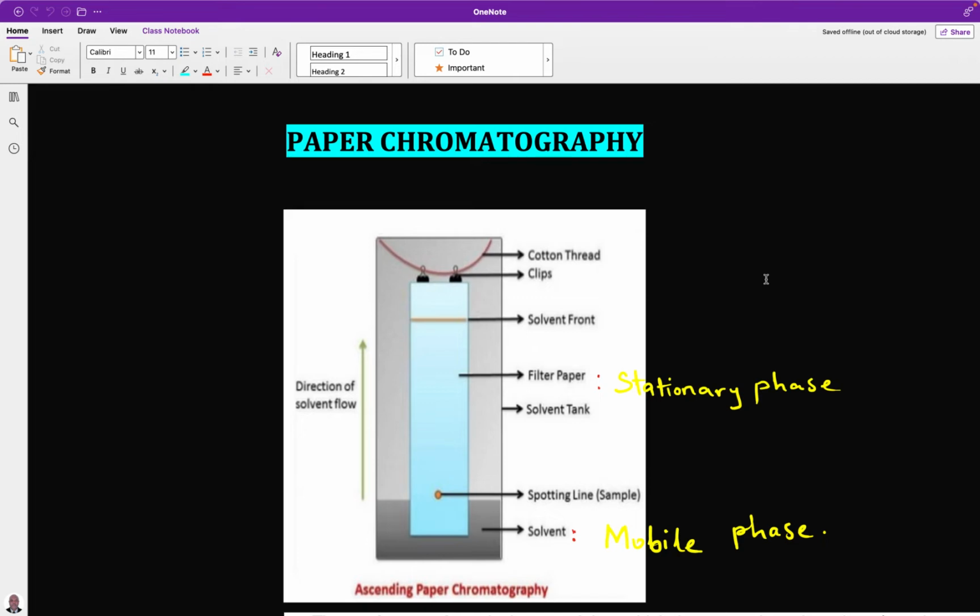In research centers, it is used for the analysis of a reaction mixture in a biochemical laboratory. It is also used in the environmental sector and the water supply companies, to determine the level of pollutants or the level of impurities in water supply.